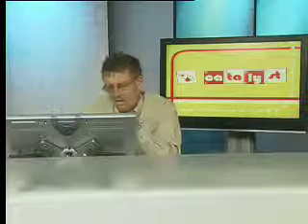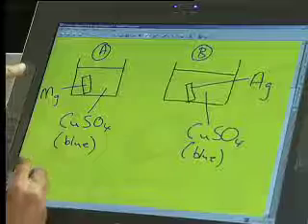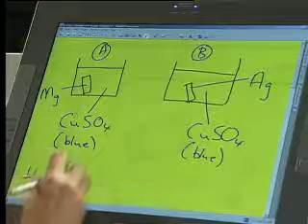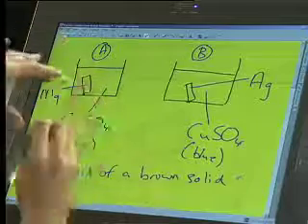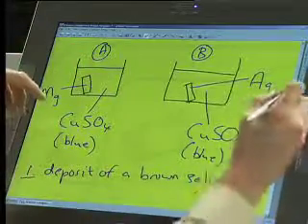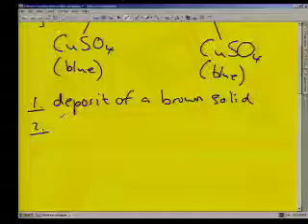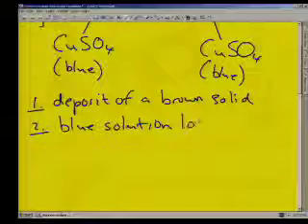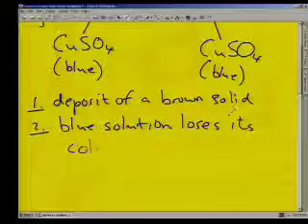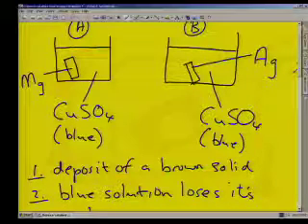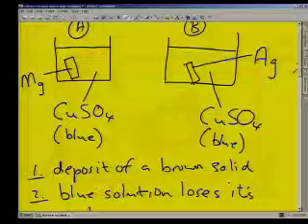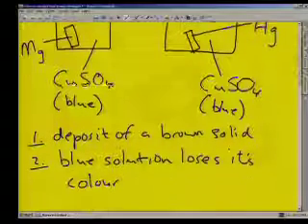So what are we going to observe? Over a period of time, copper sulfate is the blue solution. Magnesium will displace the copper; the copper will come out of solution and coat the magnesium. So we see two things: firstly, there's a deposit of a brown solid either on the magnesium itself or on the bottom of the container. The second thing we see is that the blue solution loses its color. If we leave it for a long period of time, it's going to lose its color completely. Magnesium goes into solution, and magnesium sulfate is a colorless solution, so over a period of time the blue solution will turn colorless.